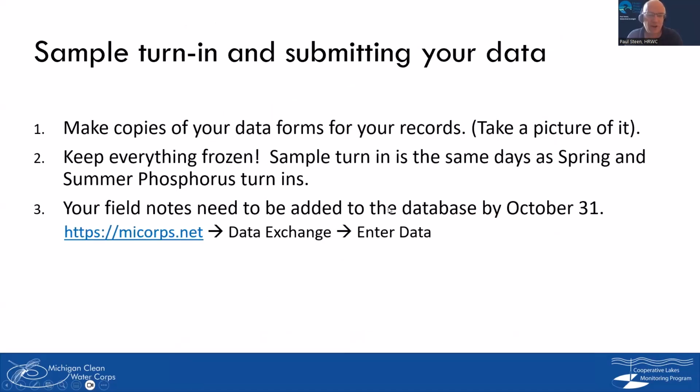And then it's time to turn it in. Make sure you make copies of your data forms. Nowadays, it's very easy to do that just by taking a picture with your phone of your data sheet. Usually those are very high resolution. It will show everything nicely. And then you turn in your original data sheet with your sample. You keep everything frozen. Just as a reminder, the sample turn-in is the same day as you're turning in your spring or summer phosphorus. You just bring it all to that point at the same time.